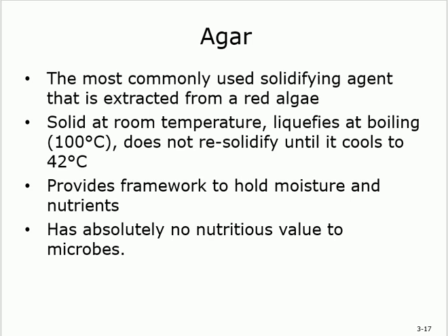So is the agar a nutrient? It's not a nutrient at all. All it's doing is changing the status, the physical state. That's number one. Number two, it puts like a framework to keep your moisture and keep your nutrients. Is that clear? Where did you get it from?